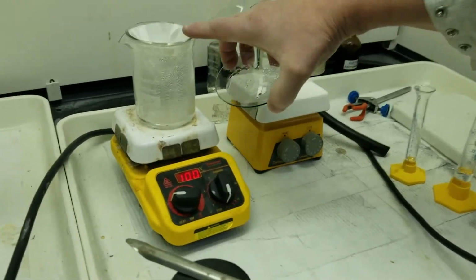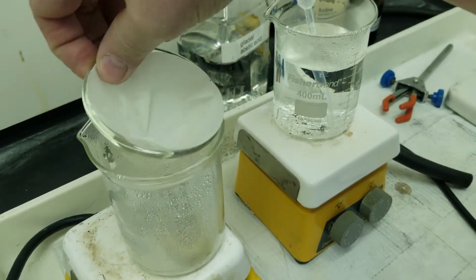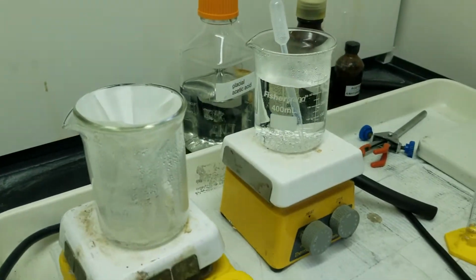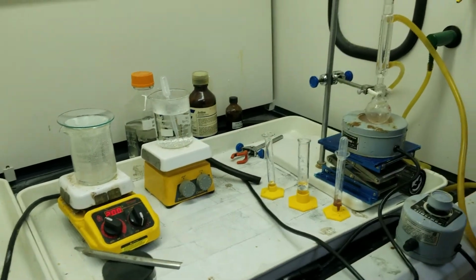This one is a fluted filter paper in a stemless funnel. Let's see if I can show you the stemless funnel. See, it has no stem. We need it to be boiling hot by the time we do the hot filtration. The watch glass helps it to keep hot, and then the other one is our boiling water.